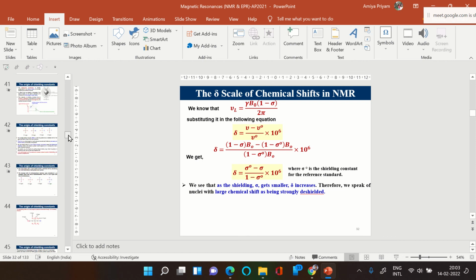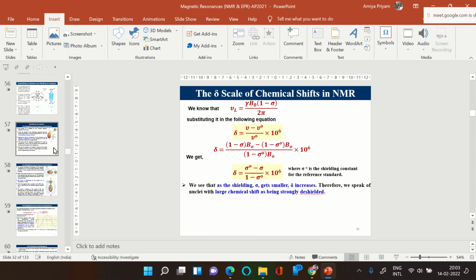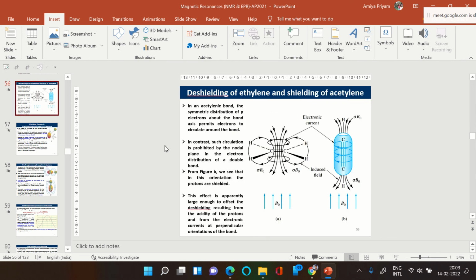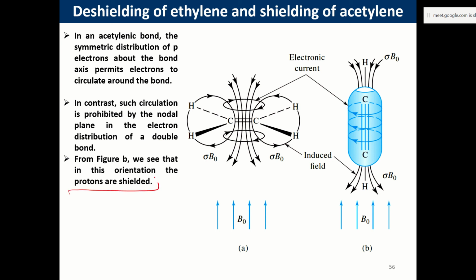In a similar way, in figure V, that is of the acetylene protons, we can see that the protons are clearly shielded.